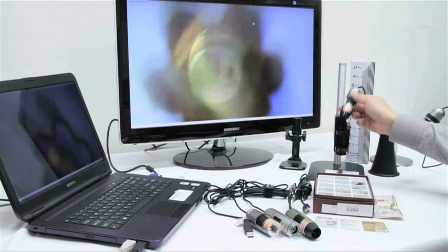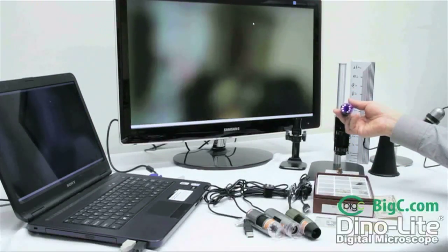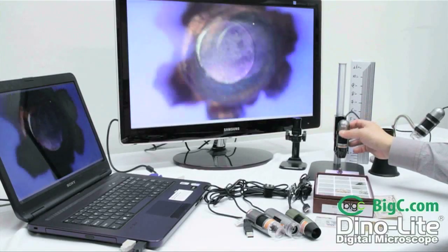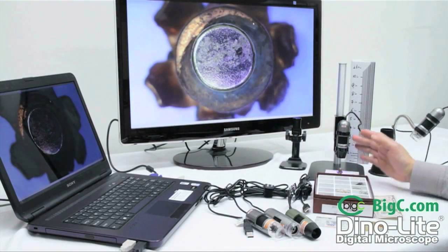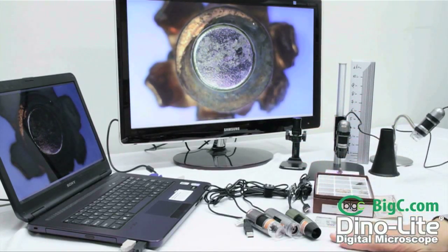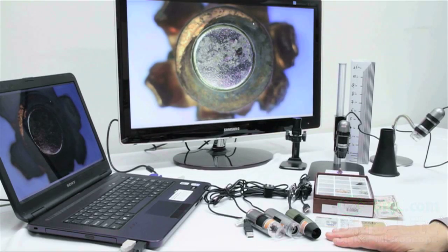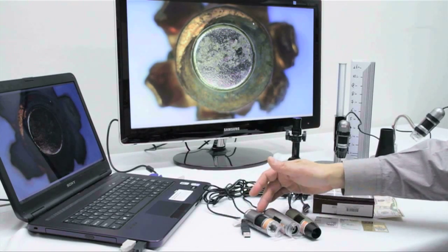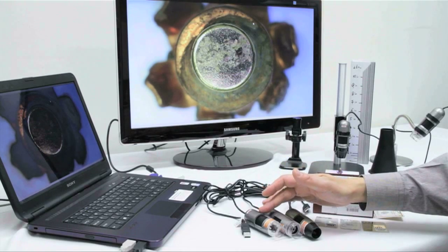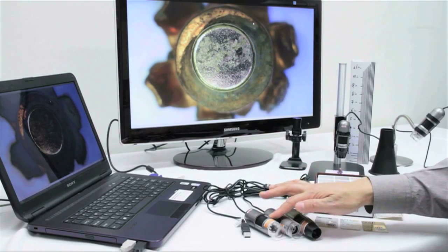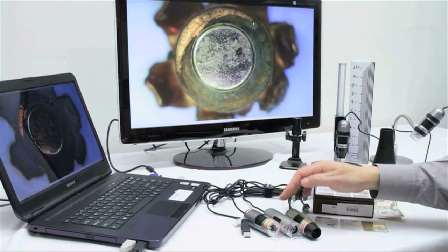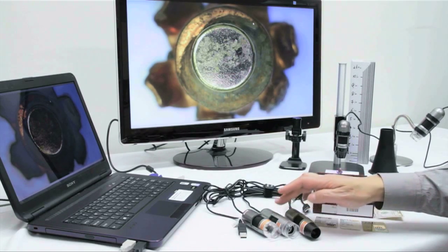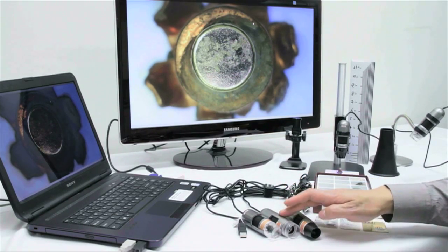We have a couple different types of microscopes that emit the UV light, such as this one here. This model that we have here to the far left is the TFVW, featuring 4 LED lights that shine white and then 4 LED lights with the UV. The next one that we have here in the middle has 4 UV LEDs as well as 4 infrared LEDs.